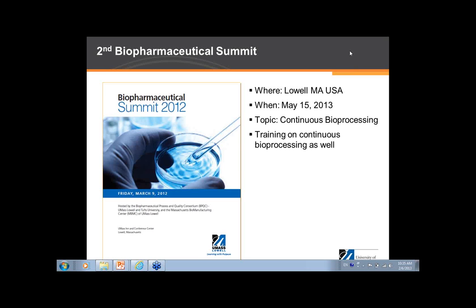I've got one question here. Could Dr. Yoon or Dr. Carville speculate if the Aber probe is measuring apoptotic cells or not? Dr. Yoon, if I could ask you to comment on that. Yes, I had one slide indicating we can measure apoptosis of the cell and some compositional changes. We do not directly measure apoptosis, but based on the dielectric spectroscopy pattern and spectral shift, we are able to measure apoptosis in the cell indirectly.